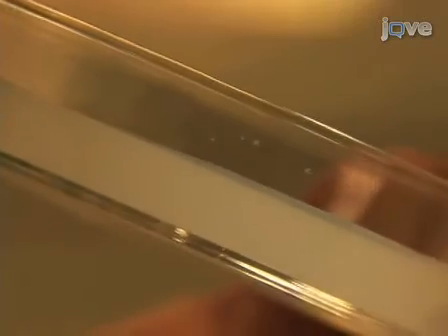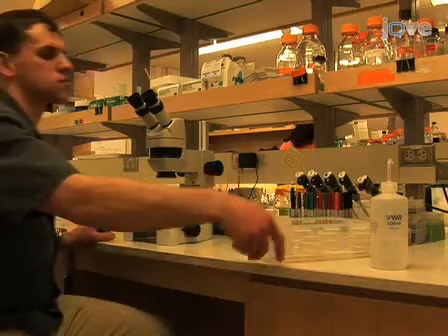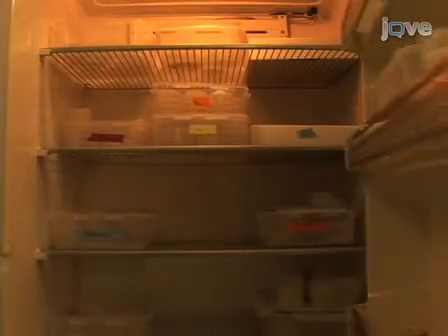Worms maintained on solid media will occasionally escape the plate surface by burrowing or crawling up the wall. Worms that flee are completely omitted from the study. When finished, return the plates to the 20 degrees Celsius incubator, wait another two to three days, and then check the plates again. Continue this regime until every worm has died.